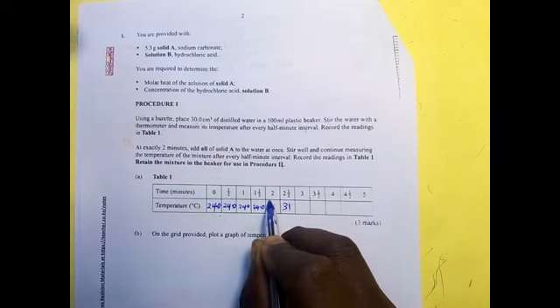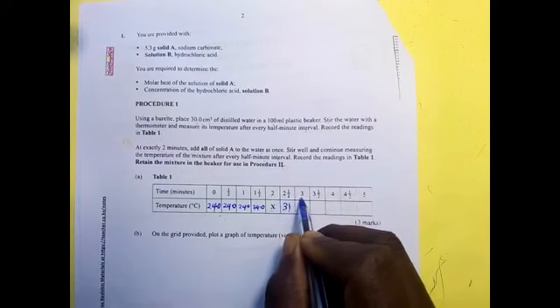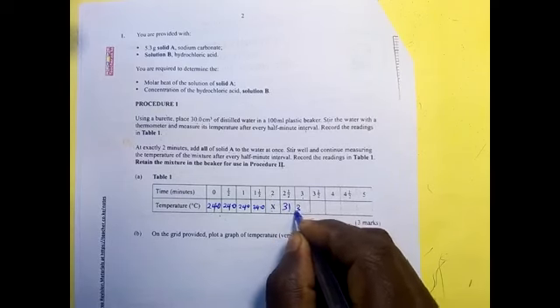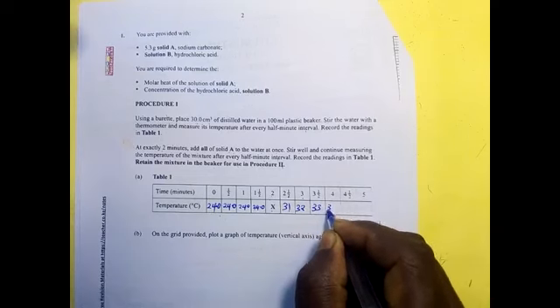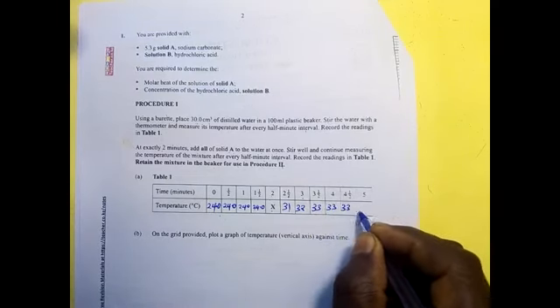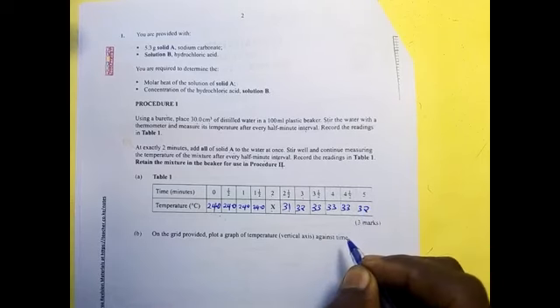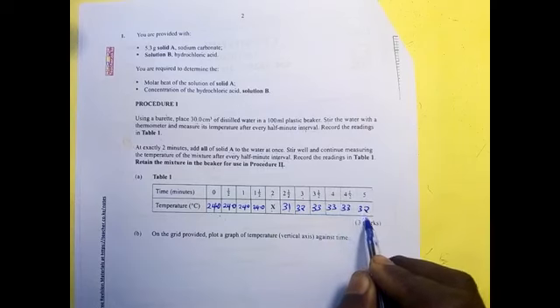After half a minute, the temperature rose up to 31. At the third minute, the temperature went to 32, and then 33, stood at 33, stood at 33, and then dropped to 32. So this is the trend, increase and then decrease.